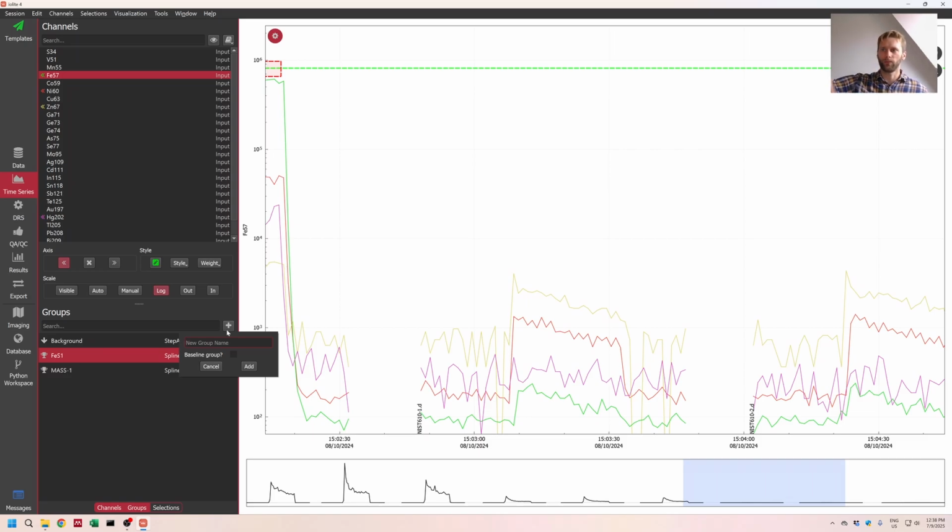And this will cause a really funny pattern with some elements, or with all elements, in your signal. And what you need to do is keep this in mind, and select only the parts of the signal that you feel confident represent the real material that you're trying to analyze.